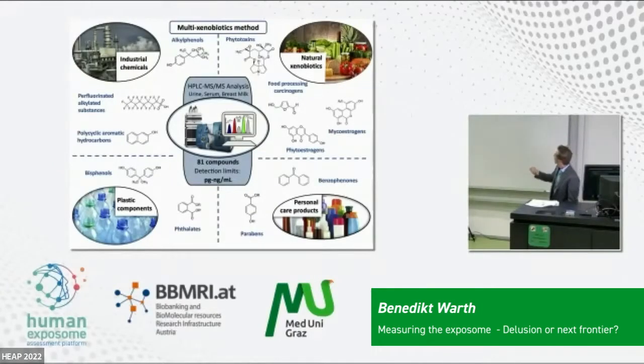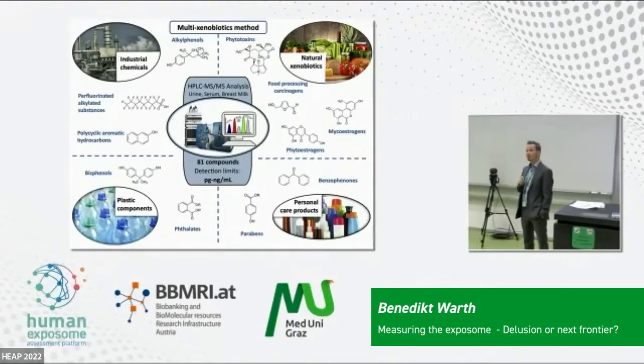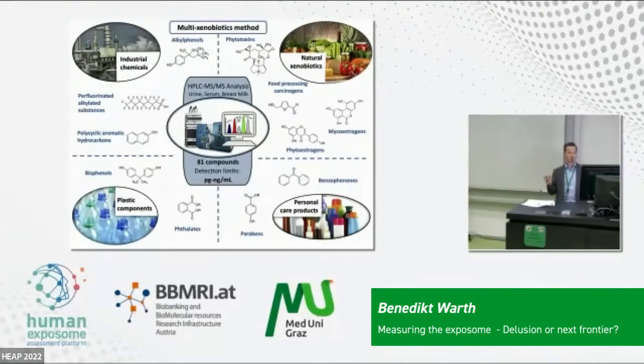More than 80 compounds that we can measure partially in the picogram per ml range, which is highly sensitive. And we could cover and validate this method for different, quite complex analytical matrices, including also breast milk. And what's important is that we did not look at specific classes.